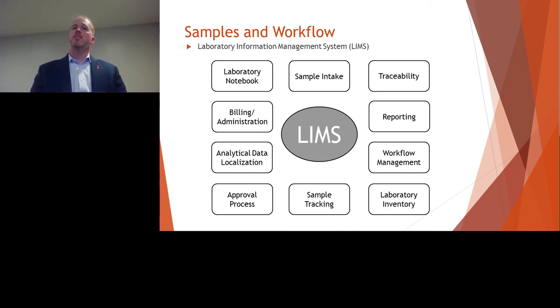It's important when you're looking at a LIMS system that it integrates with your instrumentation so that you're not transposing data or dropping it into the LIMS system. That data is pulled directly from the instruments so that there are no errors and you're not having to go back through and do a peer check of data entry. You're trying to reduce the number of locations for possible human error, because once you have systems set up, you can validate these systems, like the LIMS system and how it integrates with your instrument, so you can verify that everything works smoothly.